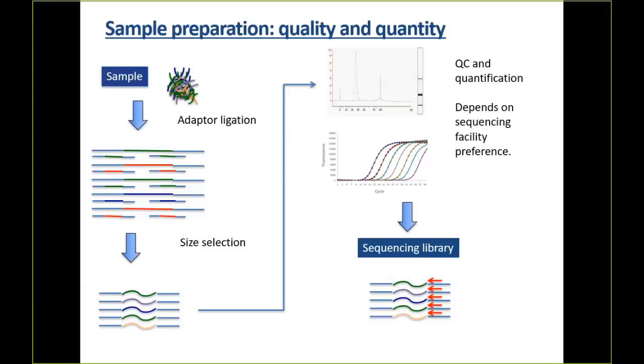If you're doing a microbiome preparation and you're making your microbiome library and you use a lysis method that basically is trying to pop the bacteria by freeze-thaw, you're going to see a lot more E. coli because you explode them all, and you're going to miss a lot of the listeria because you're going to leave them whole and they're going to get flushed out.